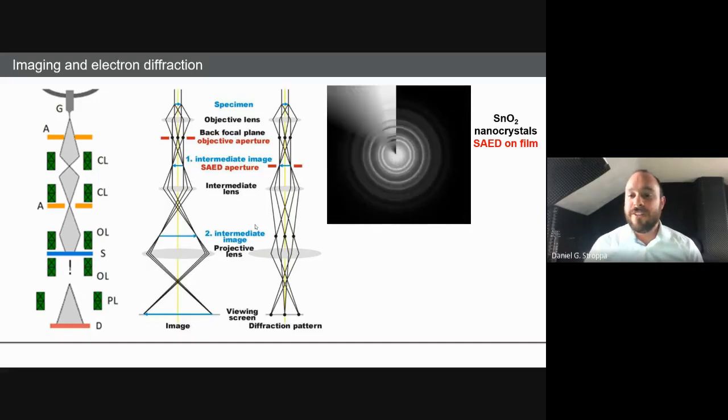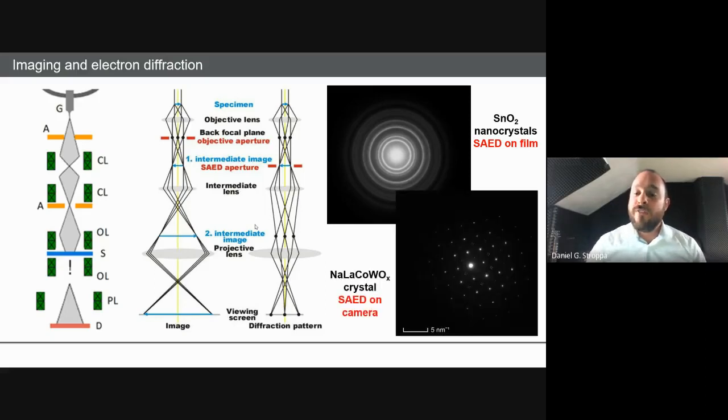So basically, what you have in polycrystalline, you have defined interplanar spaces that are going to generate your diffracted components. But then you're going to have a rotational average because you have many crystals diffracting to any direction with that particular scattering angle. And then for a monocrystal, all the atoms are in the same relative orientation, and you have this nice spot pattern.